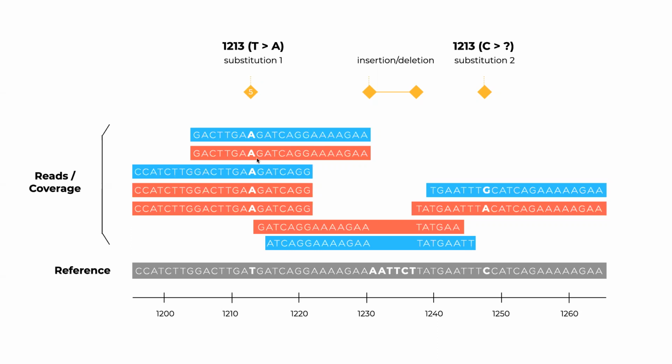In RNA genomes, the situation is even more complicated because RNA viruses have a high mutation rate. And we don't have the paired strand to really know whether that was in both strands or not. So it is more complicated. We'll talk about this in the program that we have on bioinformatics for infectious diseases. We don't have that session scheduled here, but we can talk about these methods of ultra deep sequencing that help us discover low frequency variants.